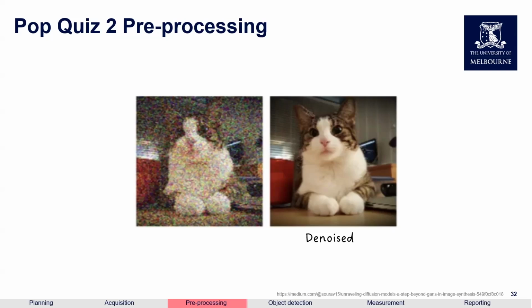It's just going to change your image into 16 bit, but the information will either stretch accordingly or just stay at exactly the same intensity value. So there's no gain. We're not getting any more information through the pre-processing step, so it also has to be set properly during the acquisition.